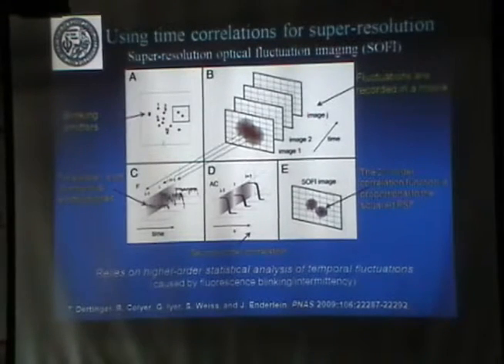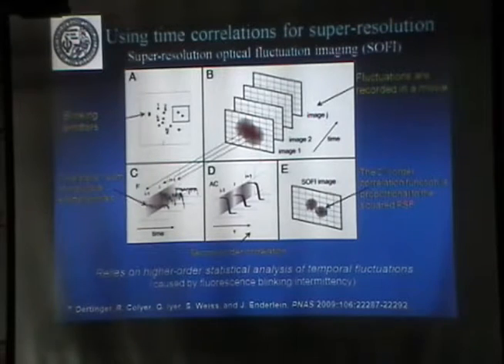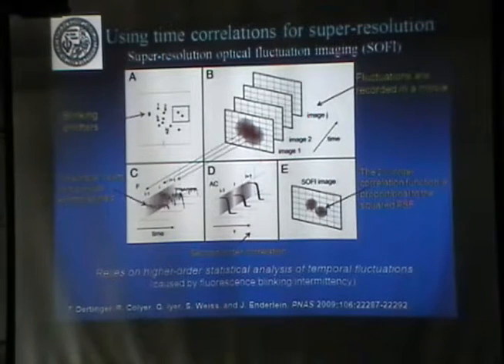Okay, there is still another way of doing things. This is using quantum dots. Okay, quantum dots is another type of emitter. These are semiconductors. So the idea here is that you want to have these emitters and you want to, again, resolve, separate them. So here you have two emitters that are close together. And if you take an image, you can't separate them.